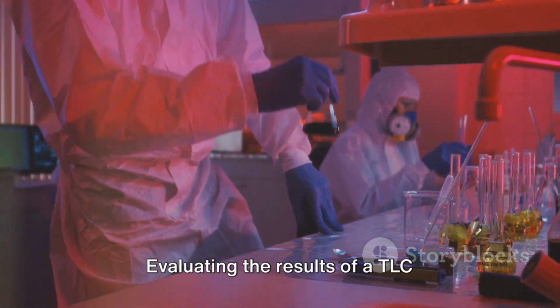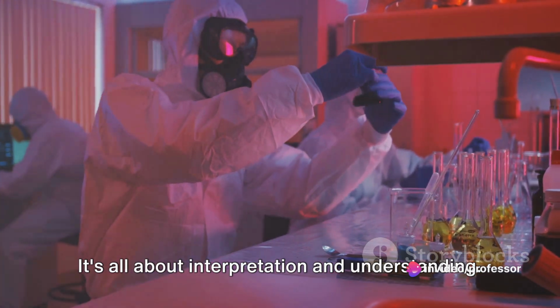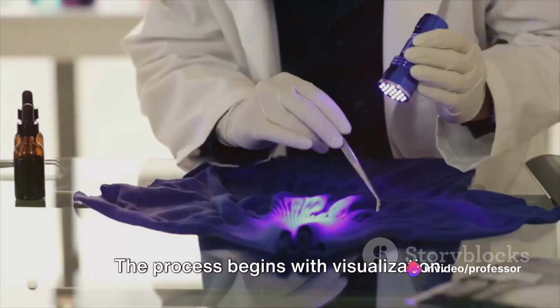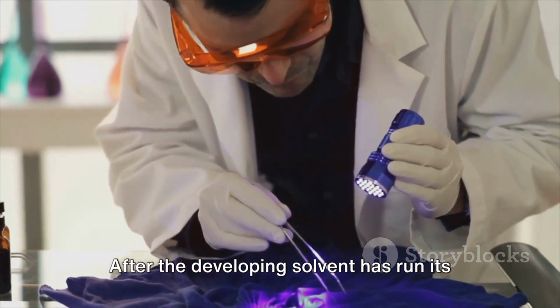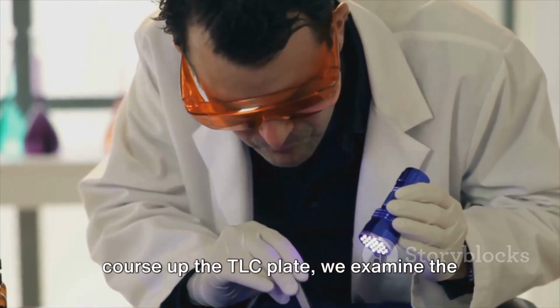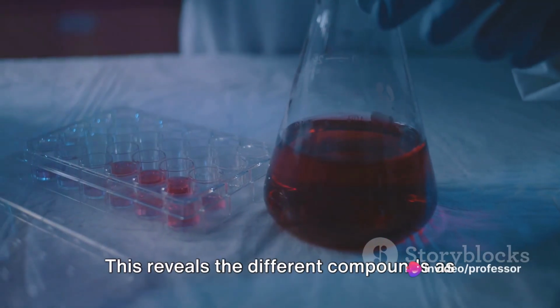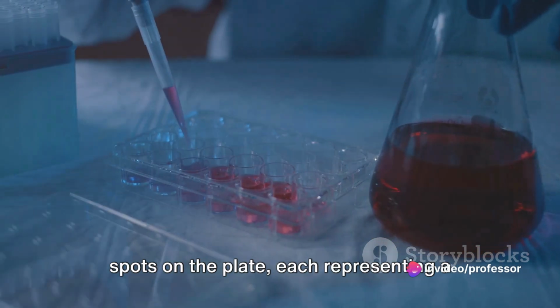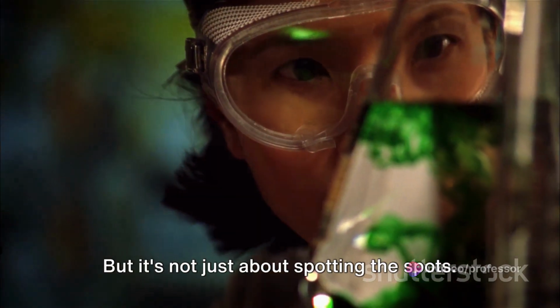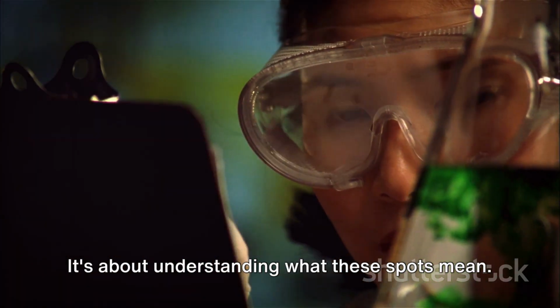Evaluating the results of a TLC experiment is a science in itself. It's all about interpretation and understanding. The process begins with visualization. After the developing solvent has run its course up the TLC plate, we examine the plate under ultraviolet light or iodine vapors. This reveals the different compounds as spots on the plate, each representing a different substance. But it's not just about spotting the spots, it's about understanding what these spots mean.